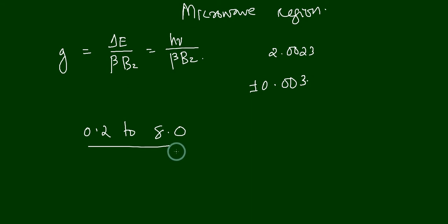So the parameter that we use in the ESR spectrum is not the frequency but the g parameter. I hope you understood this much of the ESR spectrum, and I hope you understood the principle of the ESR spectrum. We will see more things in the next classes.